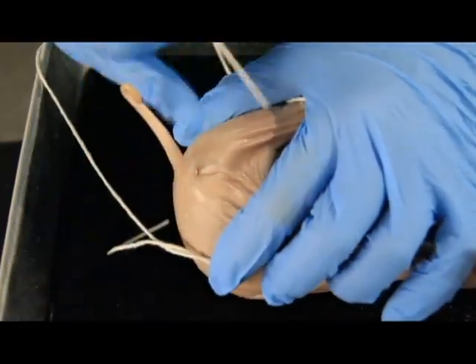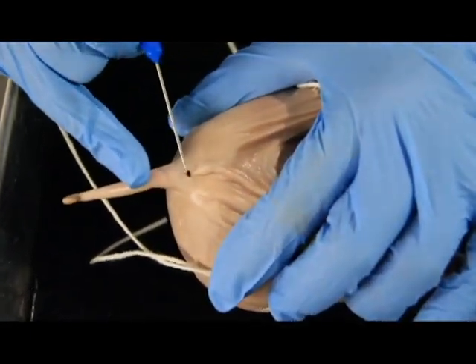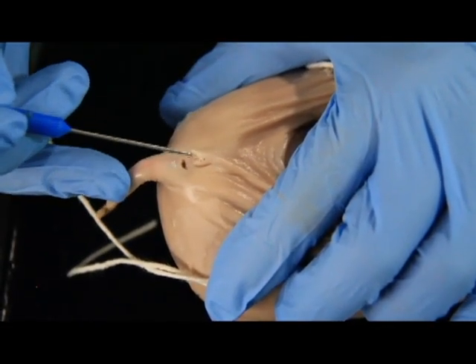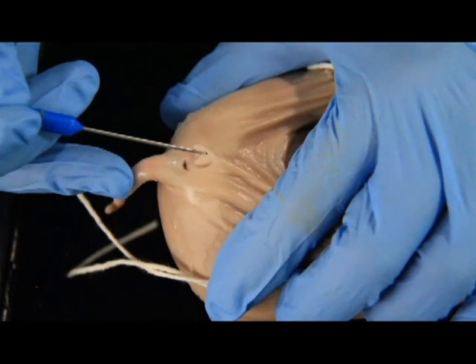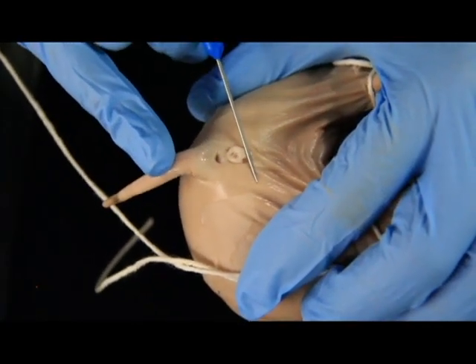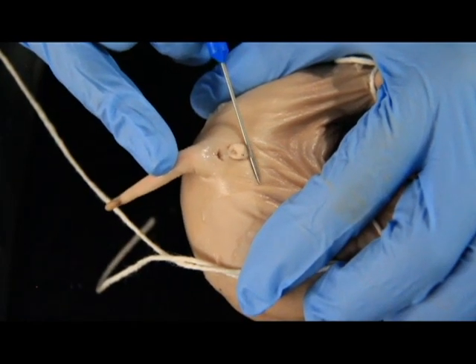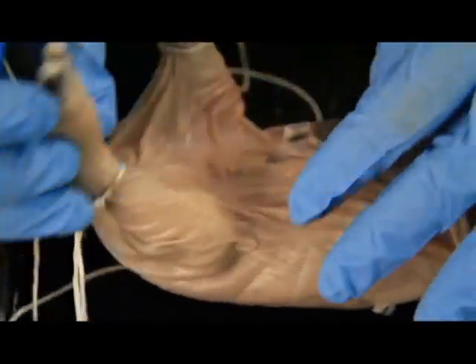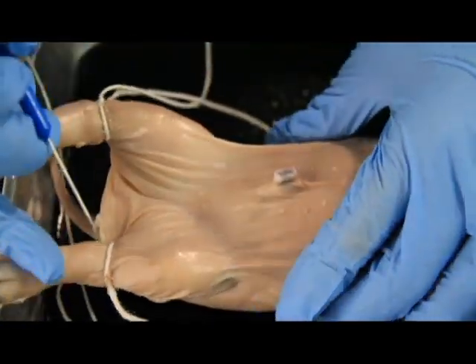So again, we lift up the tail, and right underneath the anus is this bump. And again, this little bump right here, this little flap, is known as the genital papilla. Again, papilla just means bump. And if you were to pull this back, you could see a tiny little hole. That little hole is her urogenital opening. Again, different from the male, as her urogenital opening is going to be back here, while his was up here.